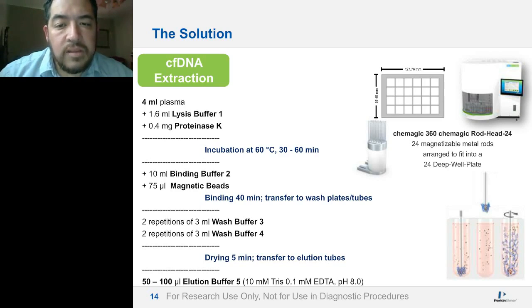And then the 360 will produce the circulating cell-free DNA, and downstream analysis is up to you as far as how you want to quantify, either using an instrument that does trace analysis looking at size fractionation, or using quantitative PCR or digital droplet PCR, depending on how long the thermocycling takes for that analysis.